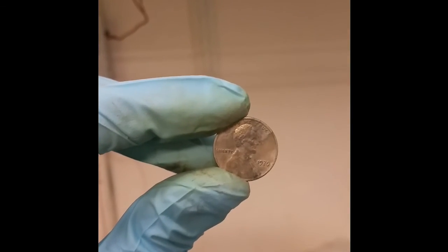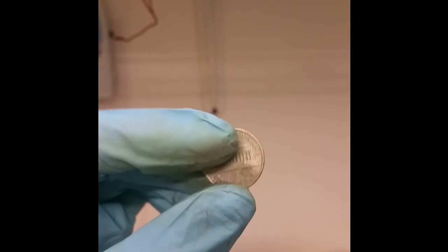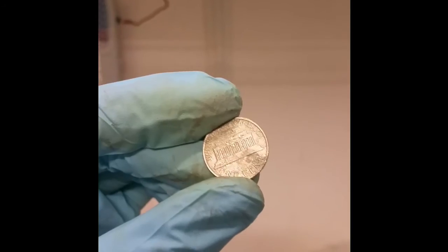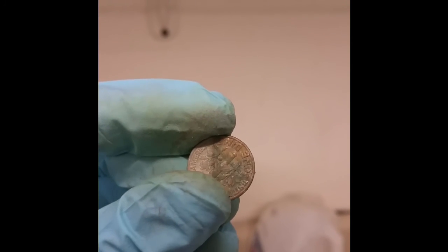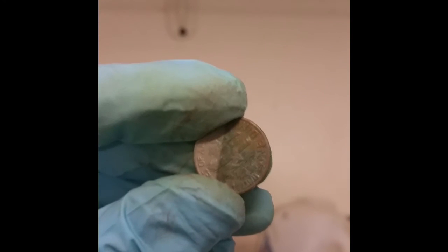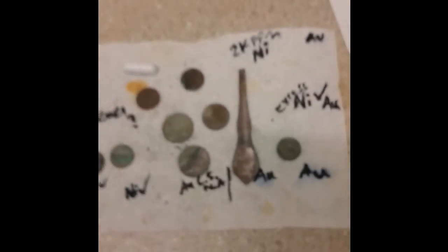I have some more here of what I've done in the past. A lot of them are kind of outdated now so they don't look too nice, but this is a penny that has been fully nickel plated — so that's no longer a coppery color at all. I've tried gold plating a lot too. On this dime you can notice a little bit of gold tint, but it's really hard to do gold plating. I'm still trying to get good at it without using any cyanide compounds — I've just been dissolving gold in aqua regia, which is HCl and HNO₃, nitric acid and hydrochloric acid. So there are a number of examples here, but that's about it for now. Let me know if you have questions. I love doing this stuff, so I can share anything I have when I get the time. See you.